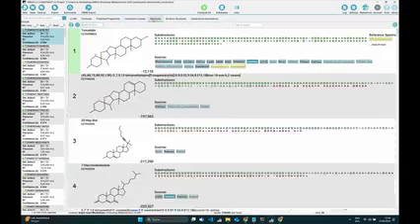Now let's go to the next step, and Markus already showed you a preview of this, and probably this is the tab you will spend most time in, or at least it's a tab that is quite important. And now we actually have done our database search, or structure database search, and found some hits. And these hits have been ranked, so we can see in the top we have the hit with a rank 1, and the score by which this is ranked is this score below, so -12 and -197 for the first two hits. So you don't get confused: higher is better, but because it's a negative number, the closer it is to 0, the better in this case. So -12 is quite a good score for this.